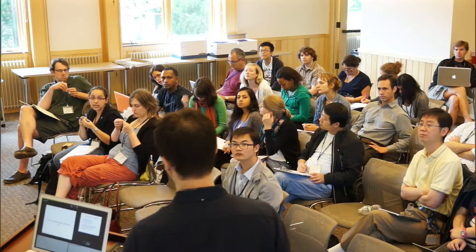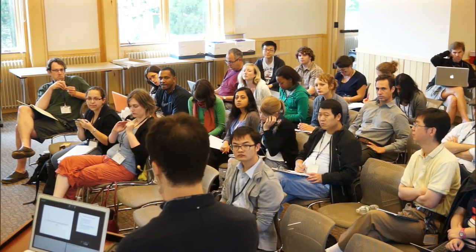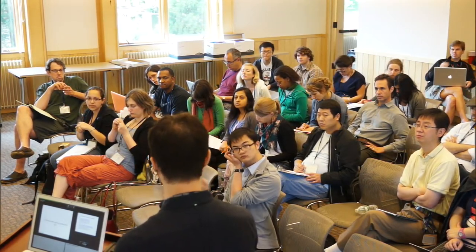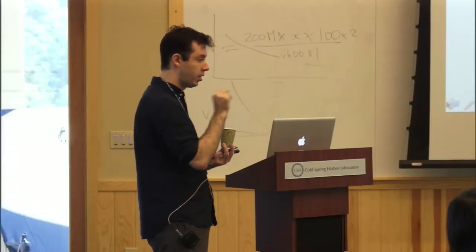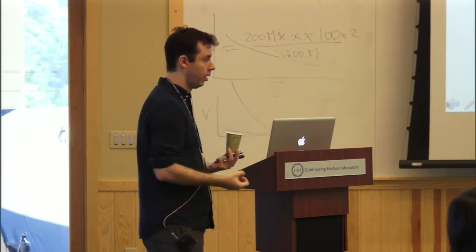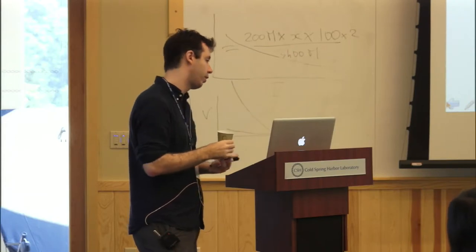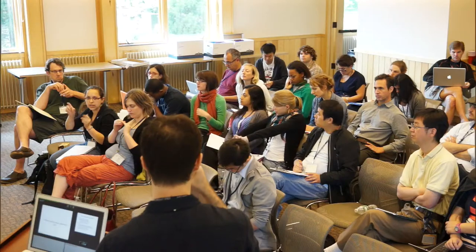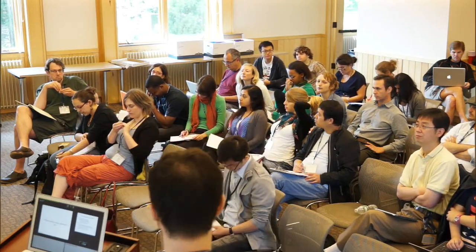That's what it does. The signal is coming from all of the fragments within the same cluster, so there's definitely averaging happening in terms of signal. You have thousands of fragments within the same spot, and each of the fragments gives a little fluorescence, and that adds up to a strong signal. So there's a summing up of the signal. The quality that you get is per cluster, like in the FASTQ files. That's right.